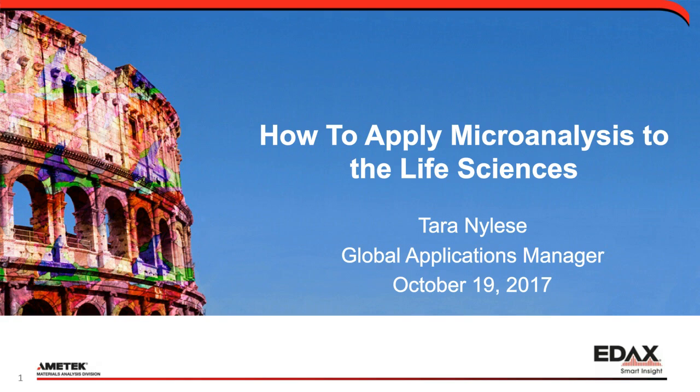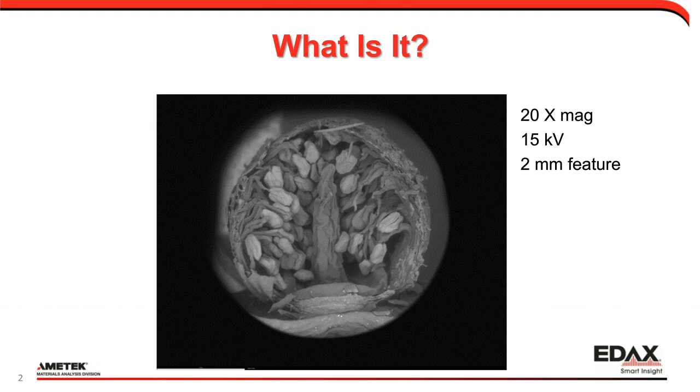To get started, I'd like to start with a little quiz or survey. This is just a little bit of fun. Recently, over the summer, we had a conference, the Microscopy and Microanalysis Conference, and I had done some work and came across this very interesting sample. I took a very low mag image of it, and it is rather large in the world of microscopy. It's a 2-millimeter feature, and I thought it was very interesting to look at. So I'd like to ask everybody to take a moment to take the poll following this slide to see what you think it is. I'll give you a couple of hints.